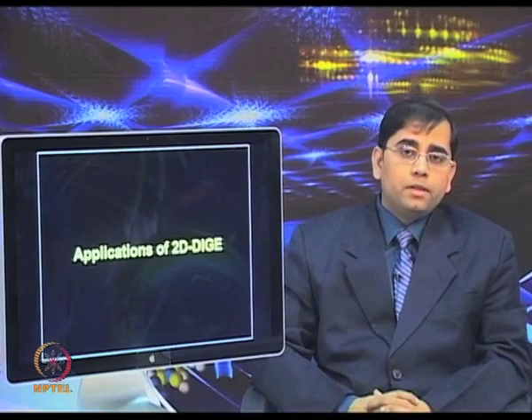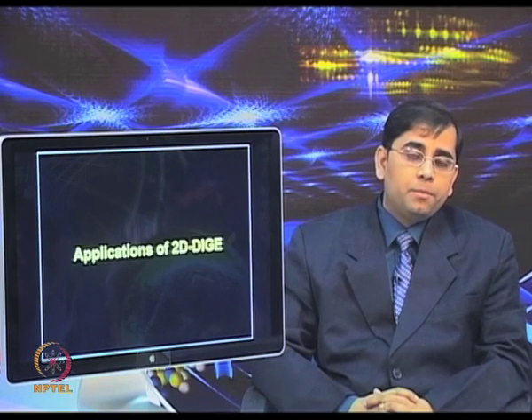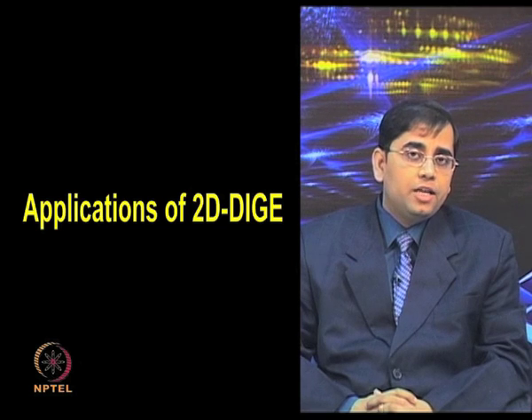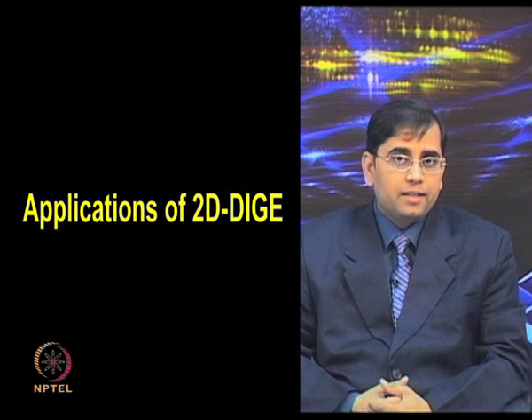So, overall the DIGE method is far more superior in terms of reproducibility as compared to conventional two-dimensional electrophoresis and for quantitative accuracy. So, therefore, applications of 2D-DIGE can be found in virtually all major biological research areas.